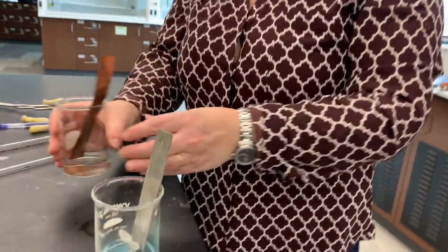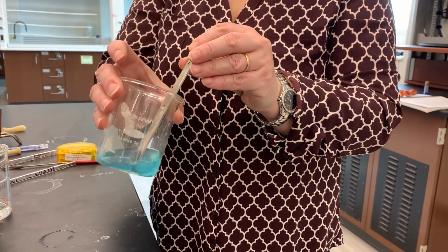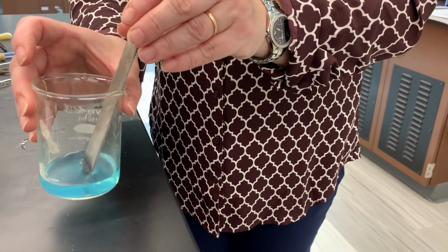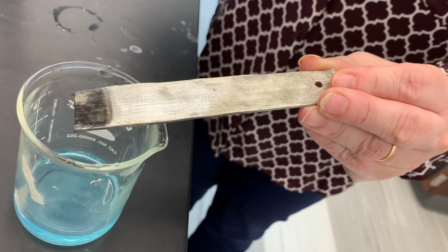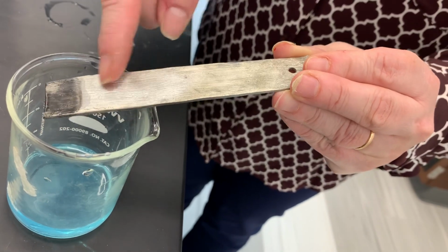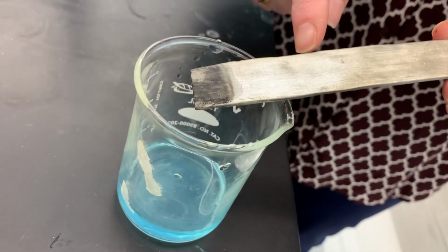This, however, is a completely different story. So one thing you may notice, I don't know how well you can see this, but the solution is kind of cloudy now. It started as clear and it is now cloudy. But most importantly, let's take a look at the surface of the zinc strip that was immersed into copper sulfate. You can clearly see the border between the original zinc, which remains gray and shiny. I did clean it with sandpaper right before I put it into the solution.